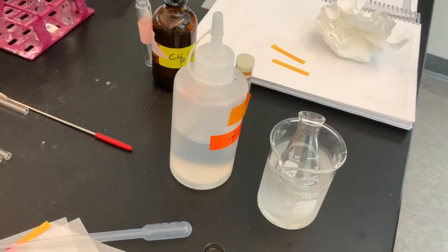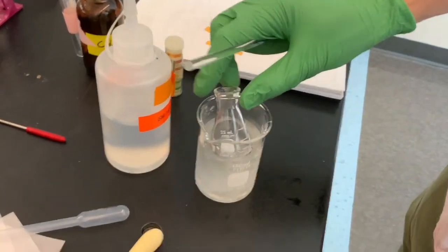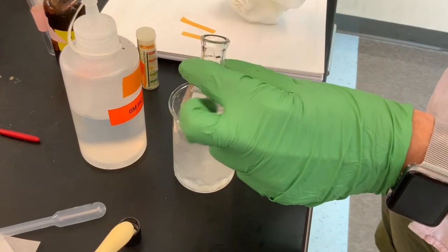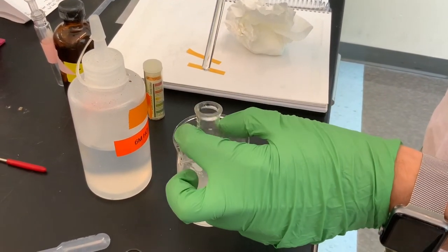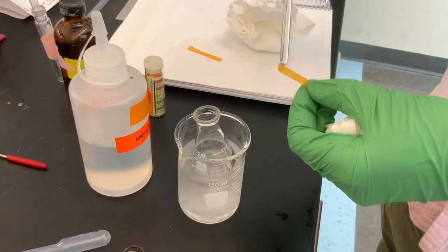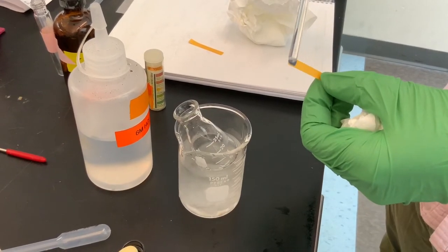And here's now a new glass stirrer. Just gonna touch down in there. Even upon chilling, we don't see any solid because it's still sodium benzoate dissolved in water. By the way, sodium benzoate is a preservative. You see it listed in a lot of foodstuffs, even sodas. So there we have it.